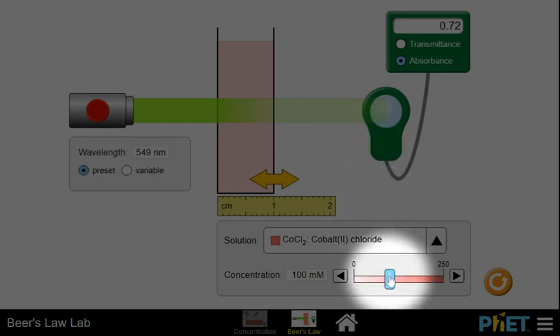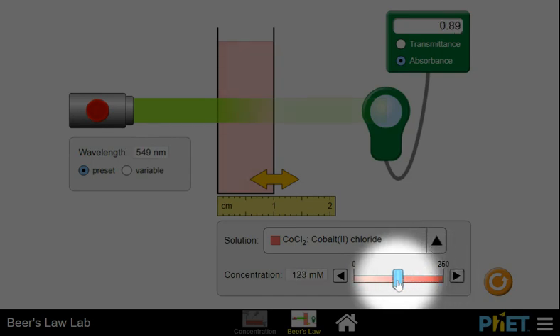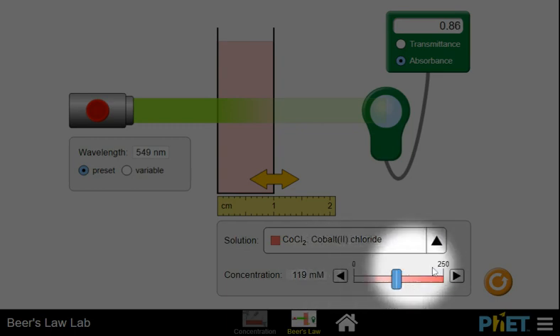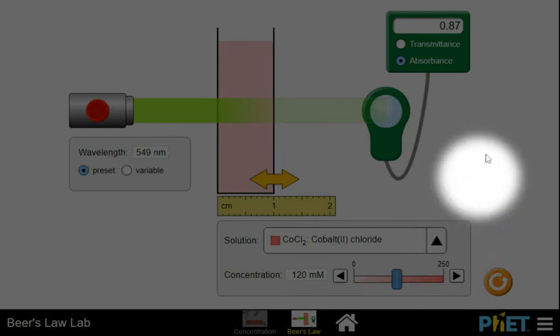You can adjust the concentration in this cell, and if you have to set it to a particular value, you can click to have a little bit better control.